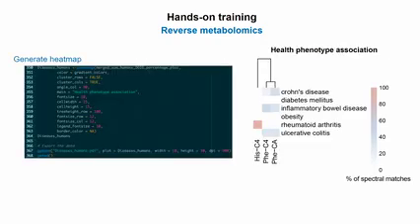So everyone was able to generate the last heat map here. How many of you did reach that part? Okay, maybe I'll wait just 2 minutes.